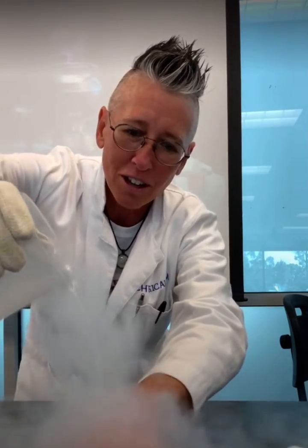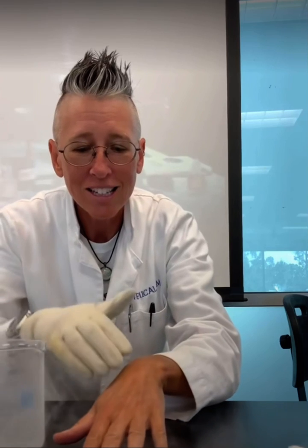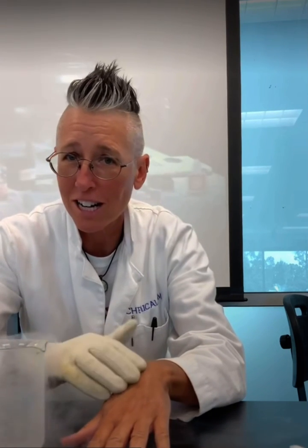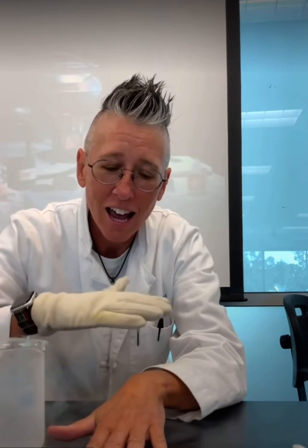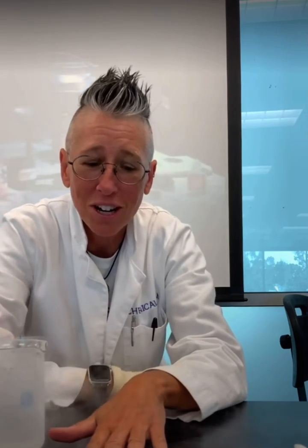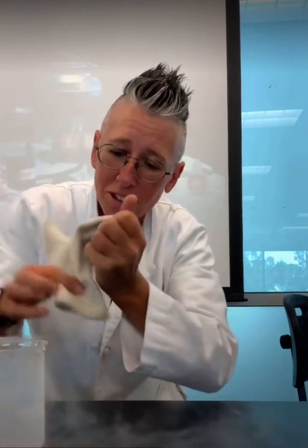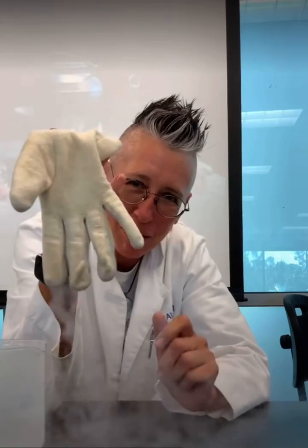When I accidentally spill the liquid nitrogen on my hand, the behavior of the liquid nitrogen is that it is actually creating a gaseous barrier that protects my hand. That is because the liquid nitrogen wants to boil on the surface of my hand, and that gaseous barrier is created which actually protects my hand.